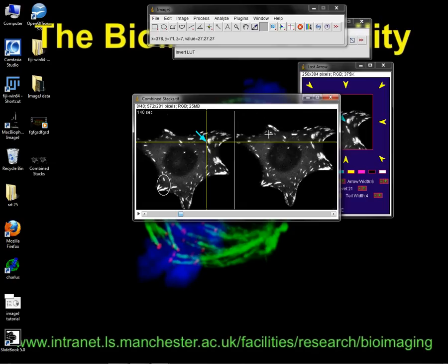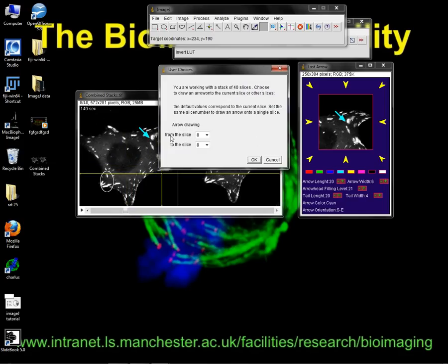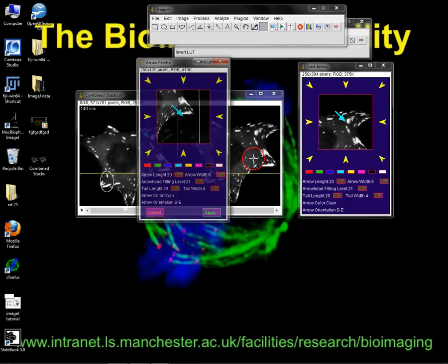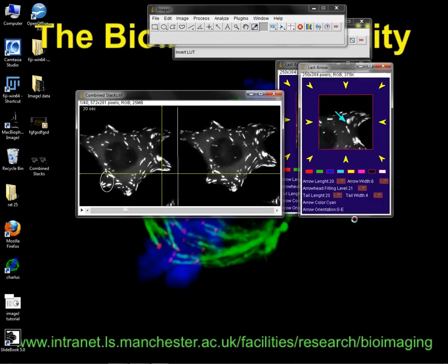So it's only there for that brief second, okay? Because we only said show it for time point 8 of 8. If we did that again, I want to label that one this time. From slice, well, all the way from the beginning, all the way through to Z section 31 this time, yeah? Okay, but what one do I want this time? Well, I don't want that. I want a nice yellow one. Pointing straight down, yeah? Apply.